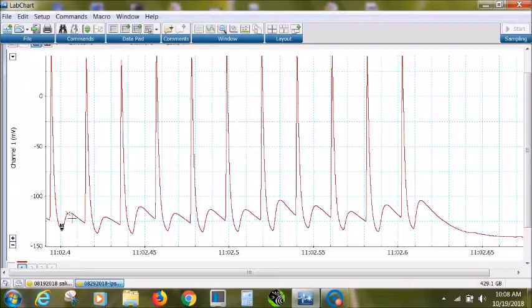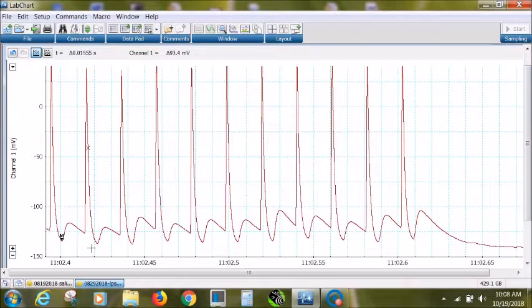And from there, we can check this one. We'll have to zoom up a little. Okay. And so you'd write down the 18.1, and then you'd move it over to the 25th.